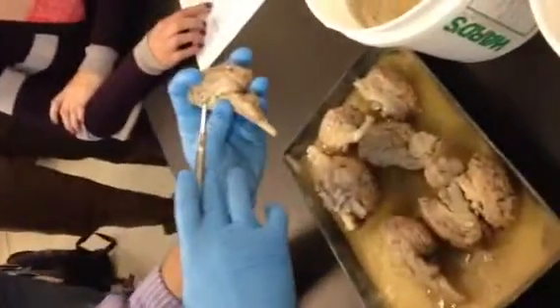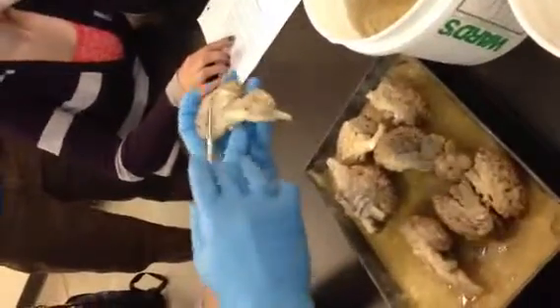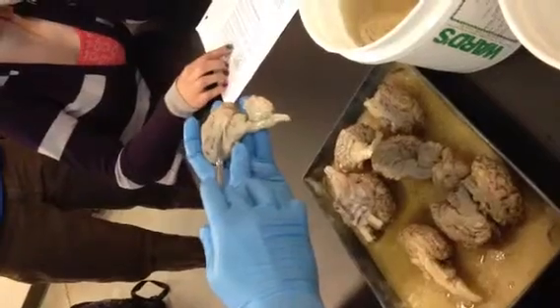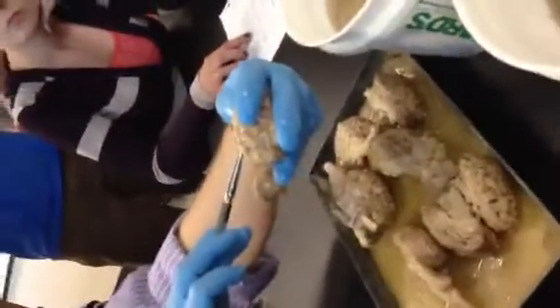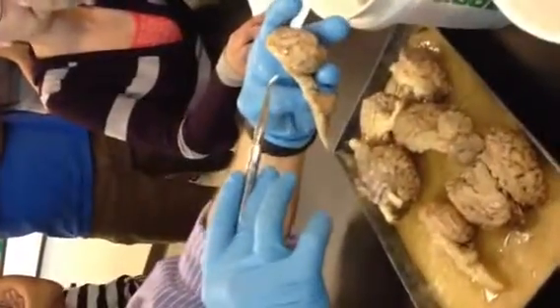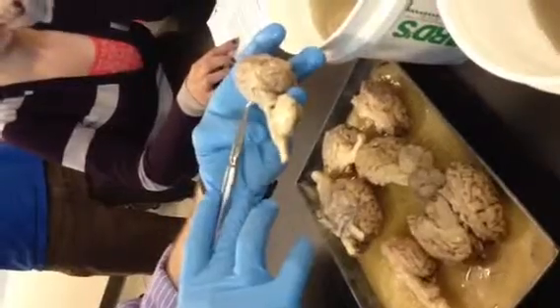Let's get our bearings here first. This is the lateral ventricle. You see that opening? Lateral ventricle. Now, below, remember I said the thalamus is located below the lateral ventricle, so this is thalamic tissue right here.